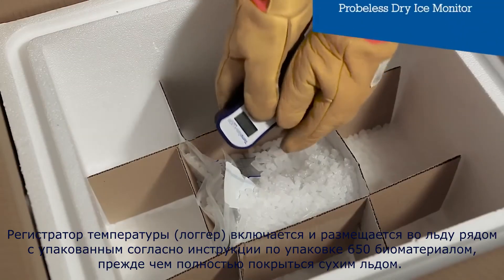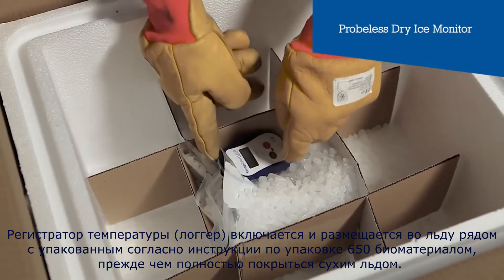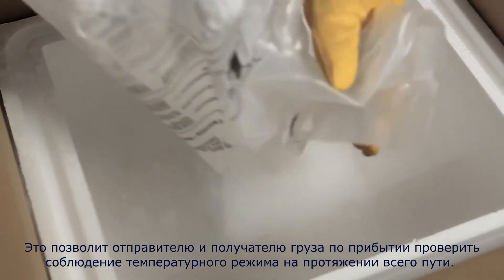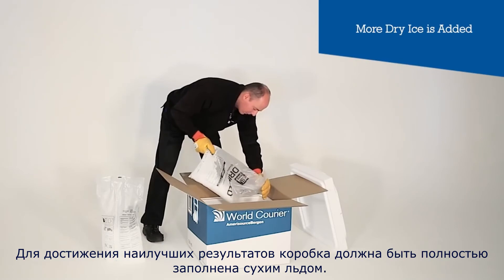A temperature monitor is activated and placed next to the PI 650 bags in the ice before being completely covered in dry ice. This will allow the shipper and consignee to check on arrival for temperature compliance throughout the journey. The box should be totally filled with dry ice for best performance.